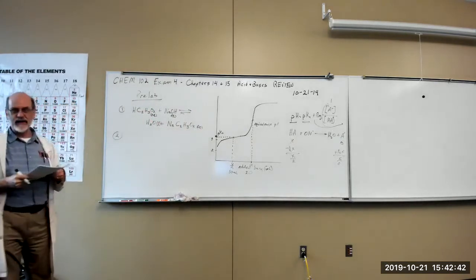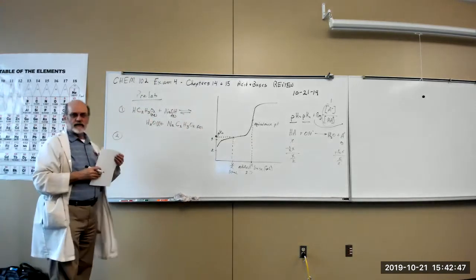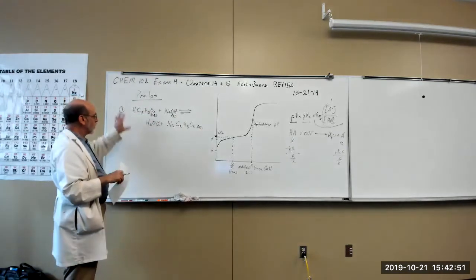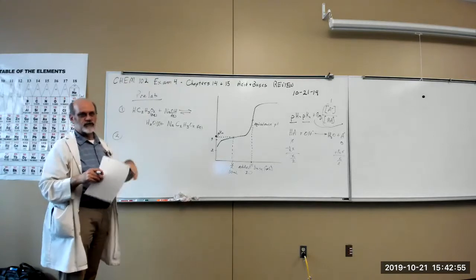Okay, any questions about that one? That's fairly simple. Whenever you're doing an acid-base titration, or any titration for that matter, you need a balanced equation to work from. You need to know what's going on in the solution.